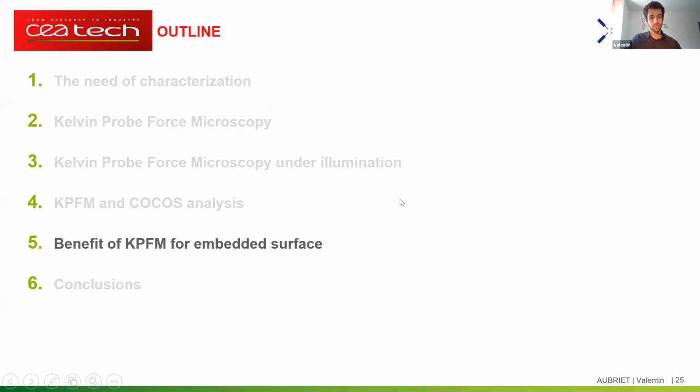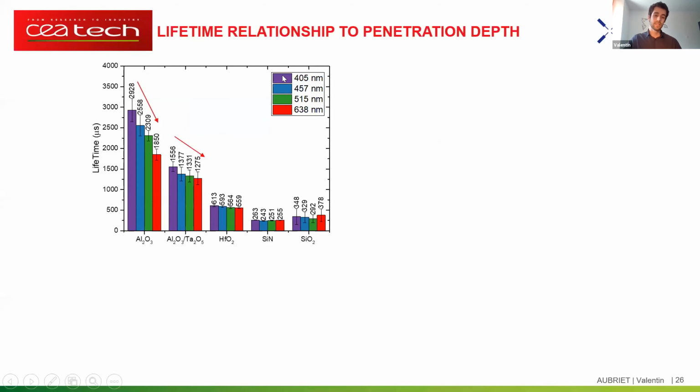So let's talk about the benefits. So here, like before, the carrier lifetime for the five passivation layers.